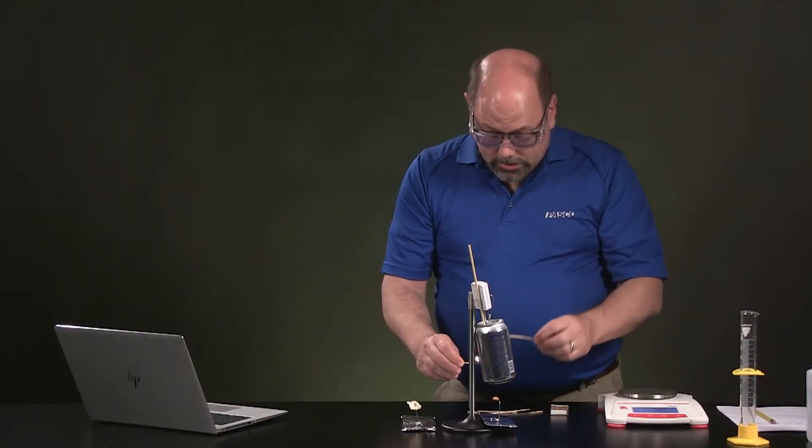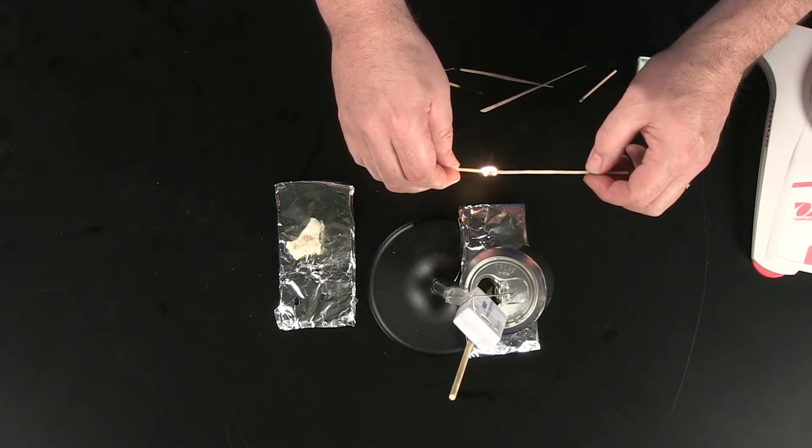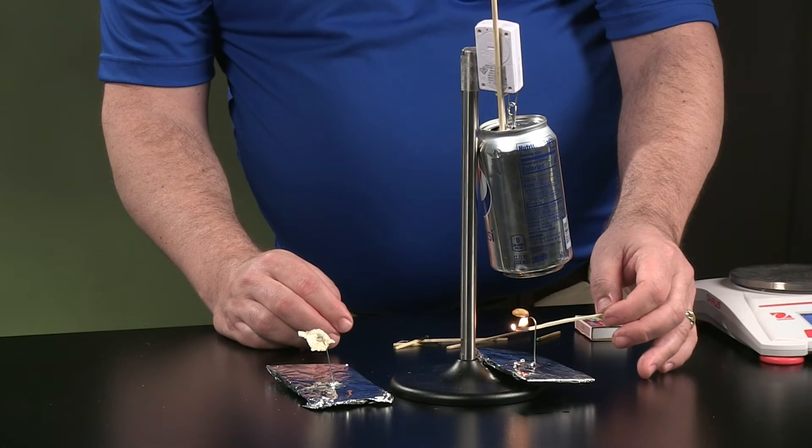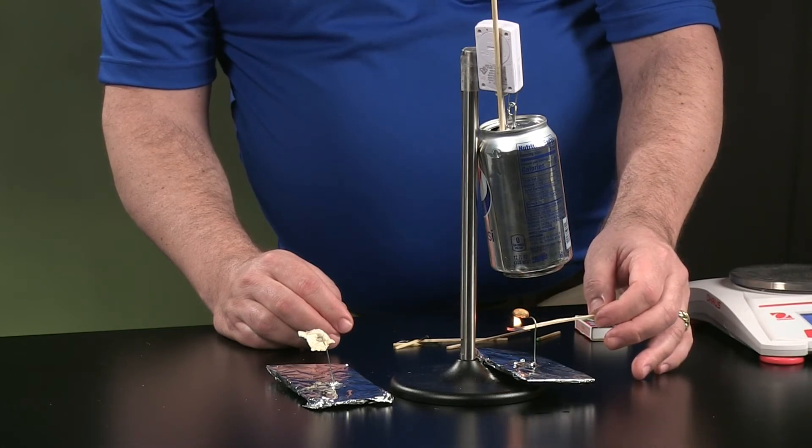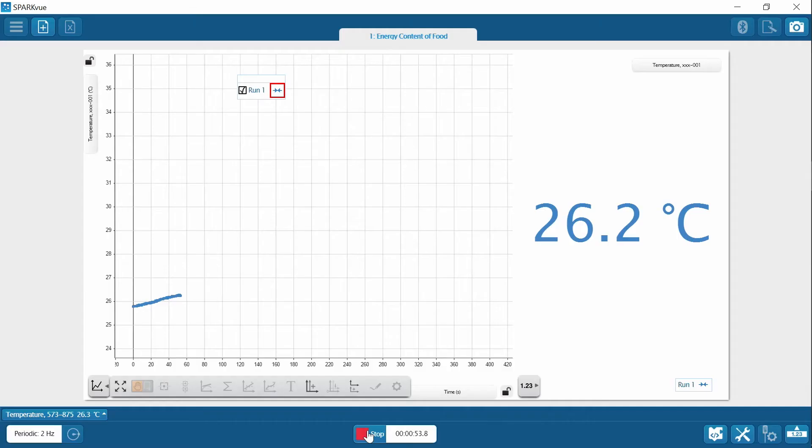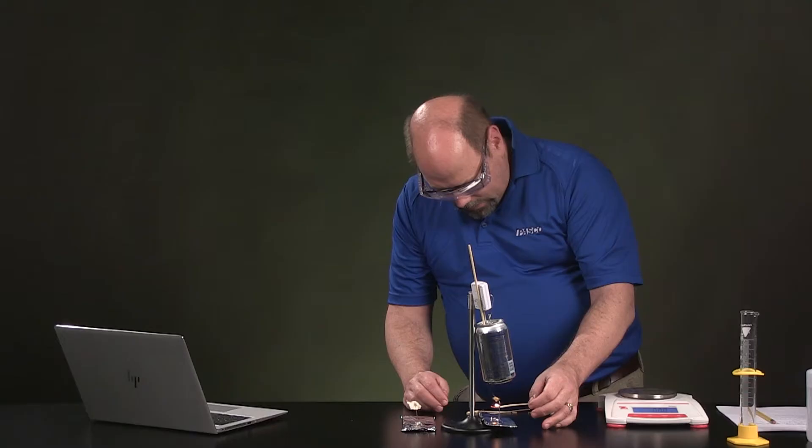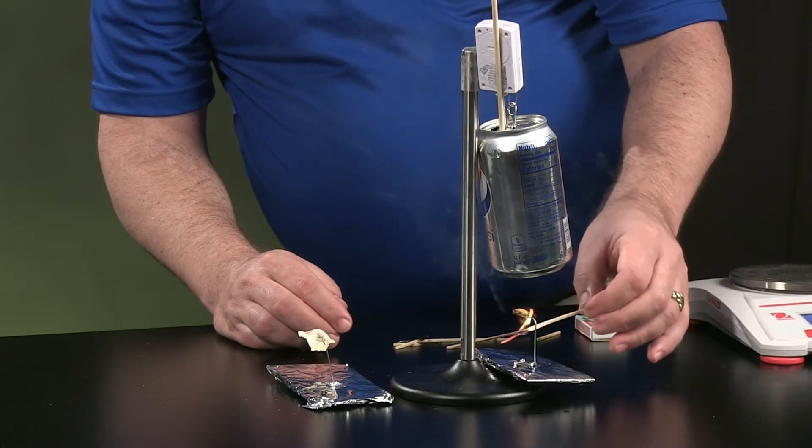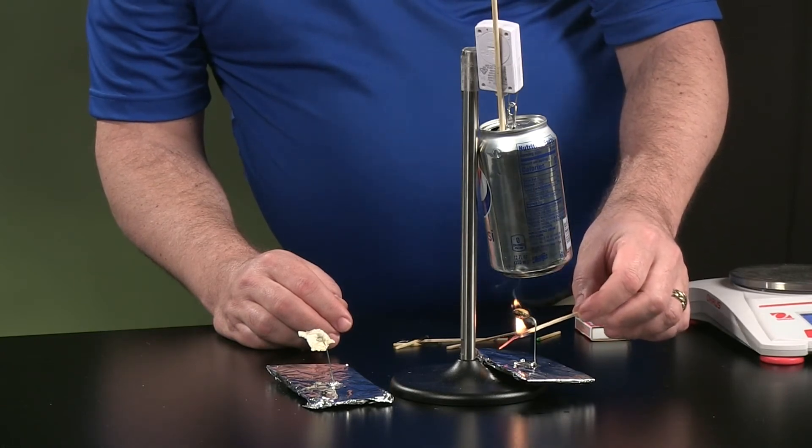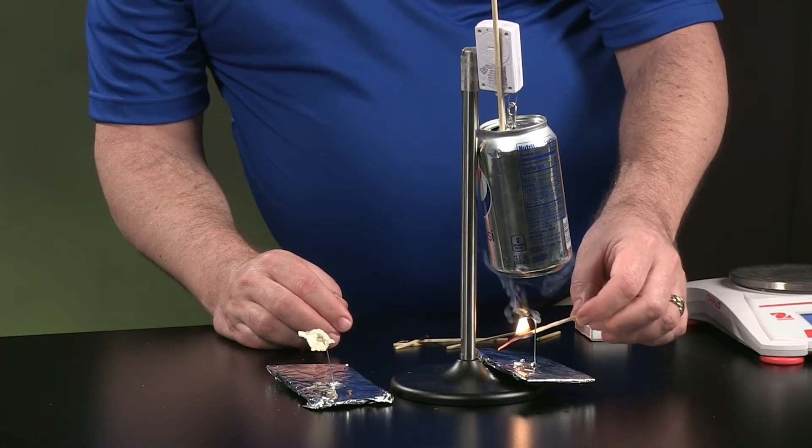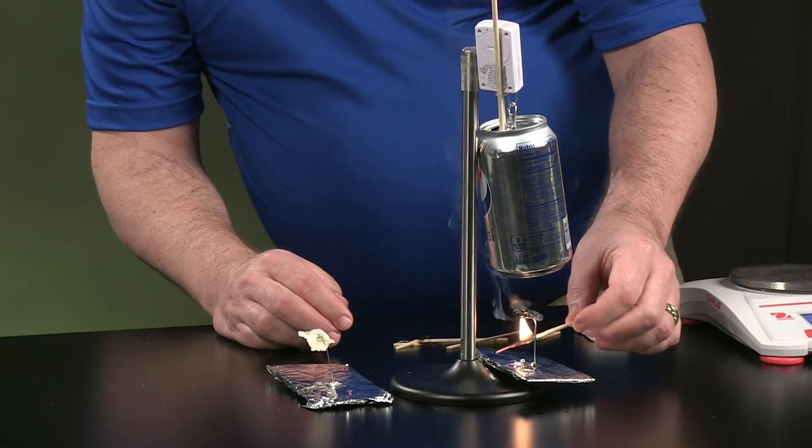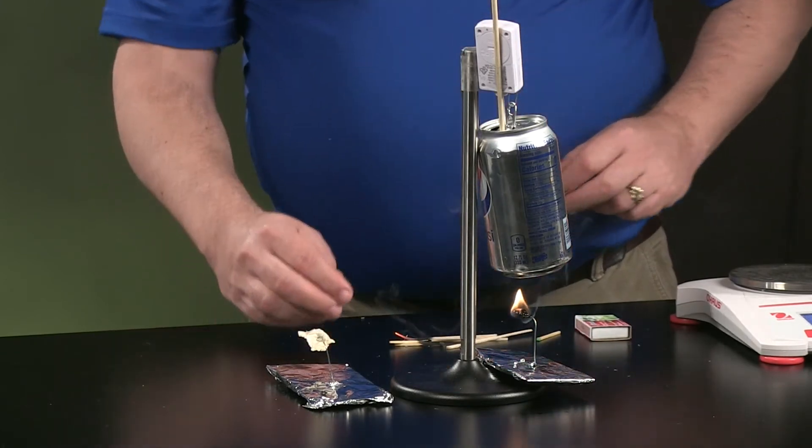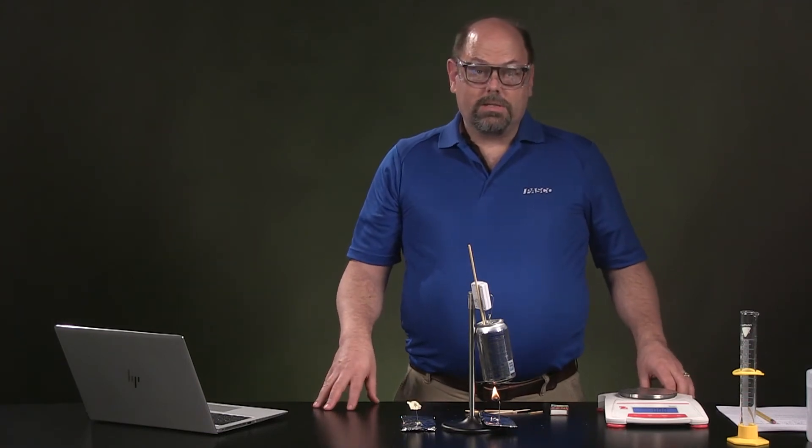We're going to use this longer stick just because that will help to get that peanut started. Sometimes they are a little tough to get burning. There we go. Data collection has started. Make sure the peanut is burning on its own before I... and then we're going to let that burn, which may take a couple of minutes. So, we're going to speed this video up.